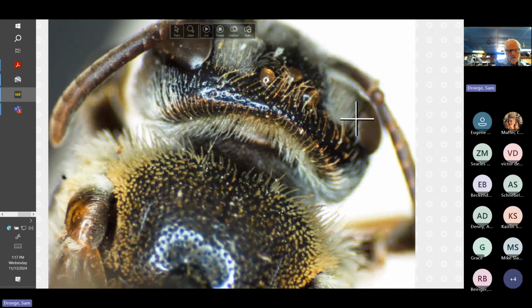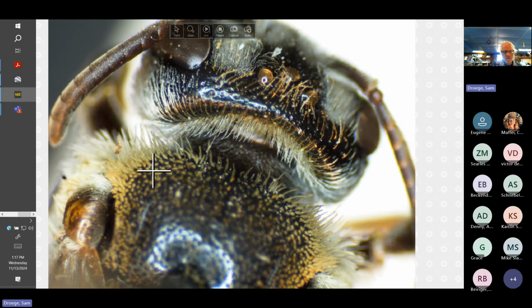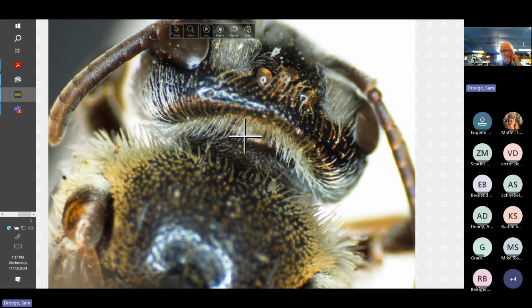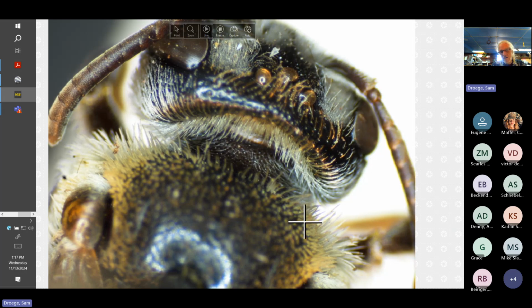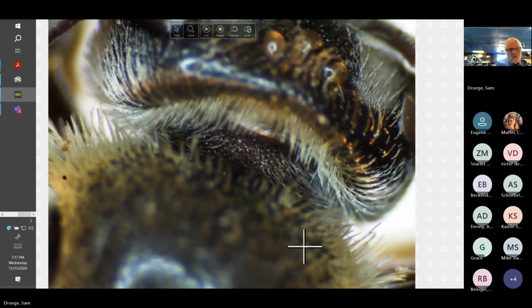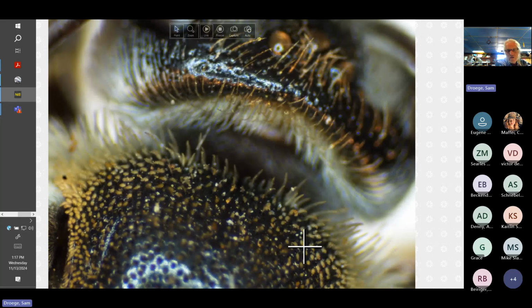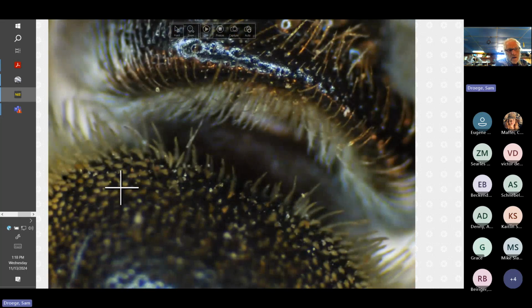So yeah, now you're looking straight down on a lot of these, but you can see that here's your basic hair that has either only a few side branches or hardly any. And then here are these thicker hairs that we're seeing to the side. All right, good. I'm glad you brought that up because that was not in my obviously older version. And we're looking straight down now, go all the way up.